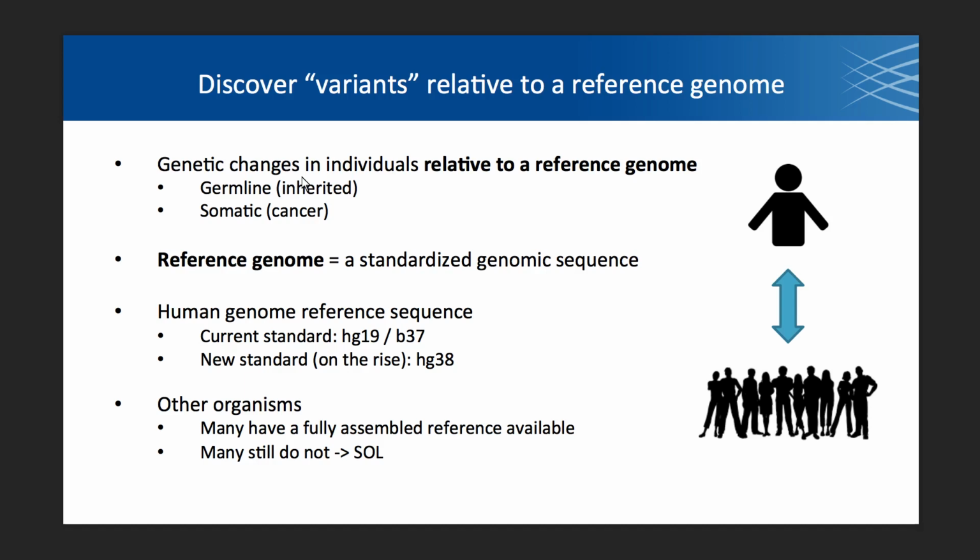So outside of the realm of human variation, a lot of organisms do have assembled references. The Broad Vertebrate Biology group did a lot of them. So, you know, there's dog, there's horse, I think there's elephant, and there's a lot of different mammals, certainly, and some other reptiles and so on and so forth. Unfortunately, if your organism doesn't have a reference, using the GATK best practices is going to be pretty hard. If you find yourself in that scenario, there are some workarounds, and there's a non-human sequencing area on the forum for people that have these difficulties, but hopefully we're all doing things that have a well-defined reference, because that makes everything else easier.